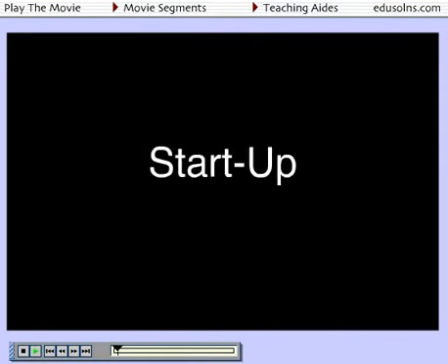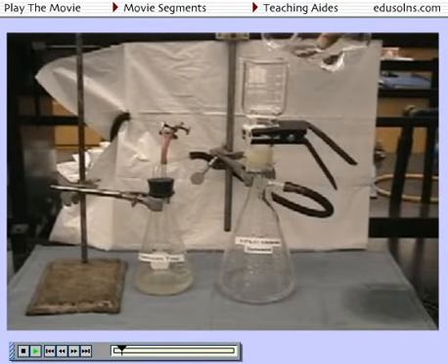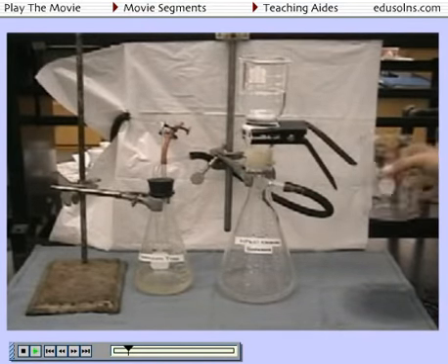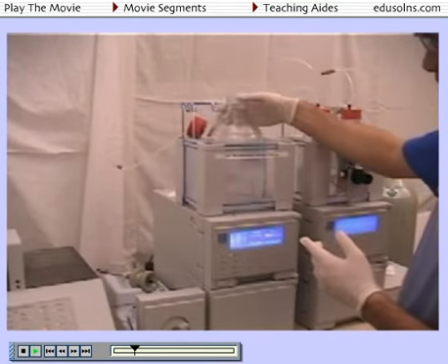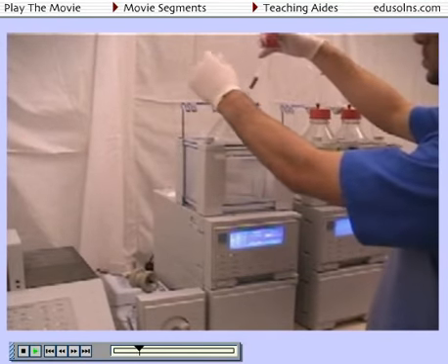Prior to startup of the HPLC, there are a few items to prepare. First, one must select and prepare the solvent gradient to be used. The proper solvent gradient can usually be obtained from the column manufacturer or from the technical applications assistant from your brand of the HPLC. These contacts will also be useful in selecting the appropriate column to be used. You should also have your calibration standards ready before you turn on the HPLC.